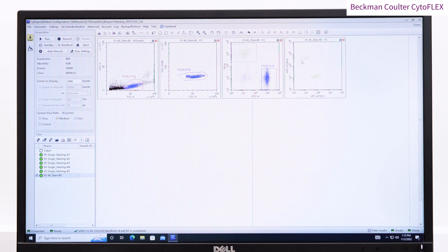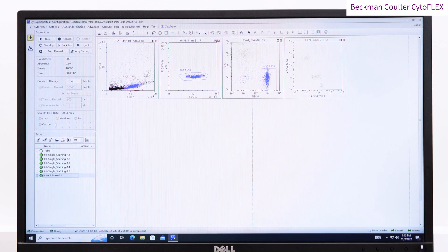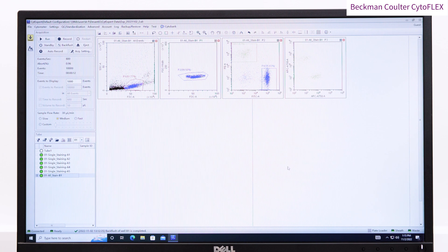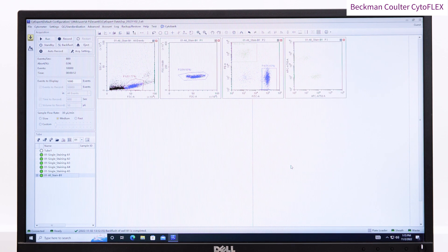We can now see the populations are nicely resolved once compensation is applied, and we can finish by displaying some basic statistics.